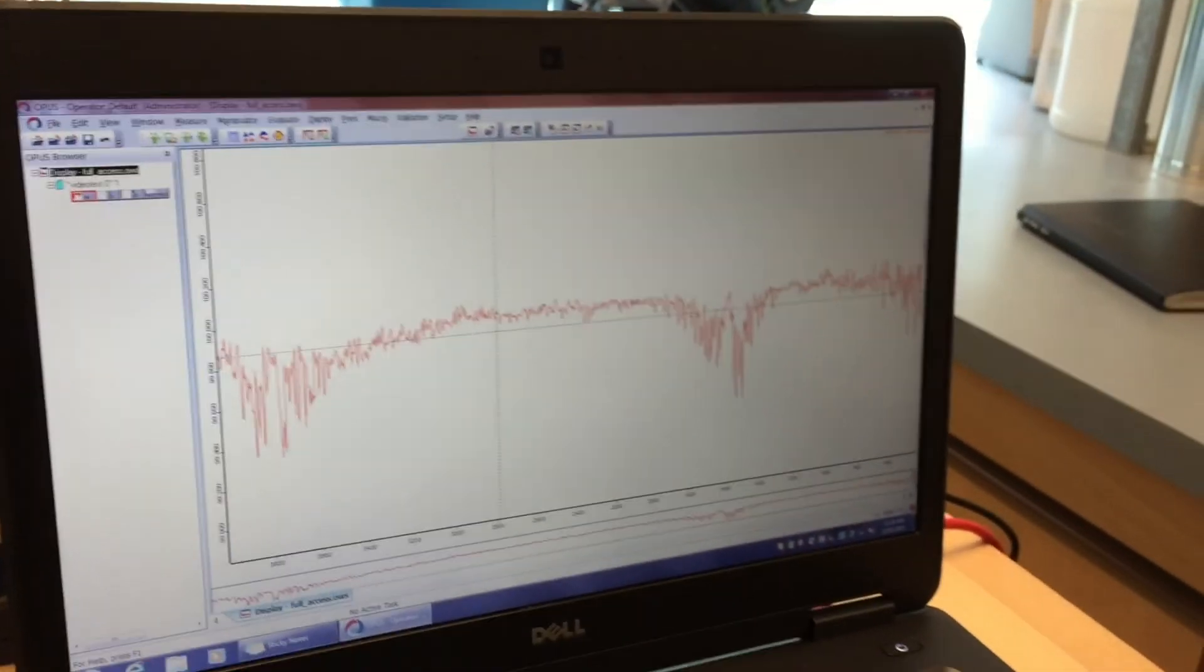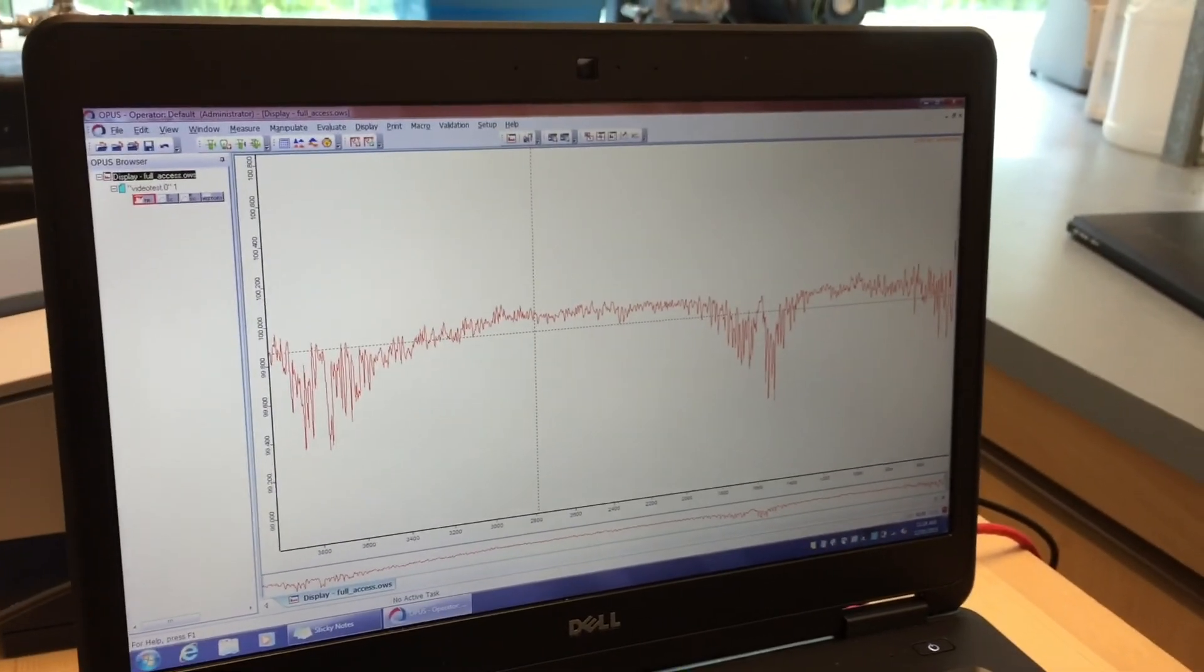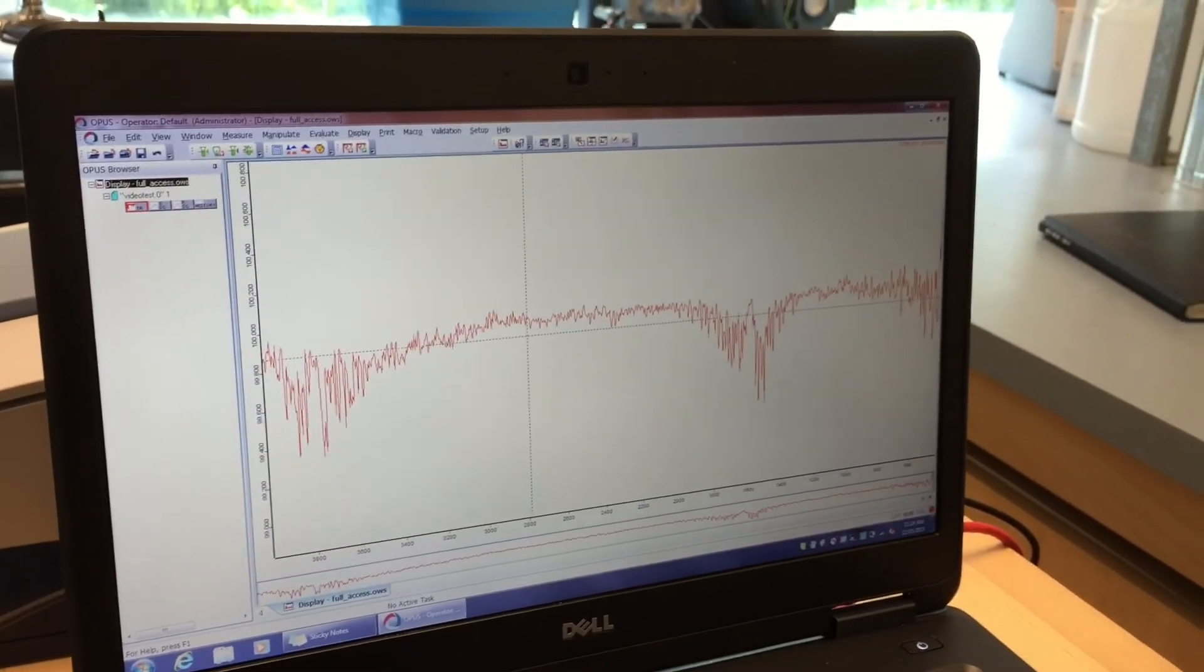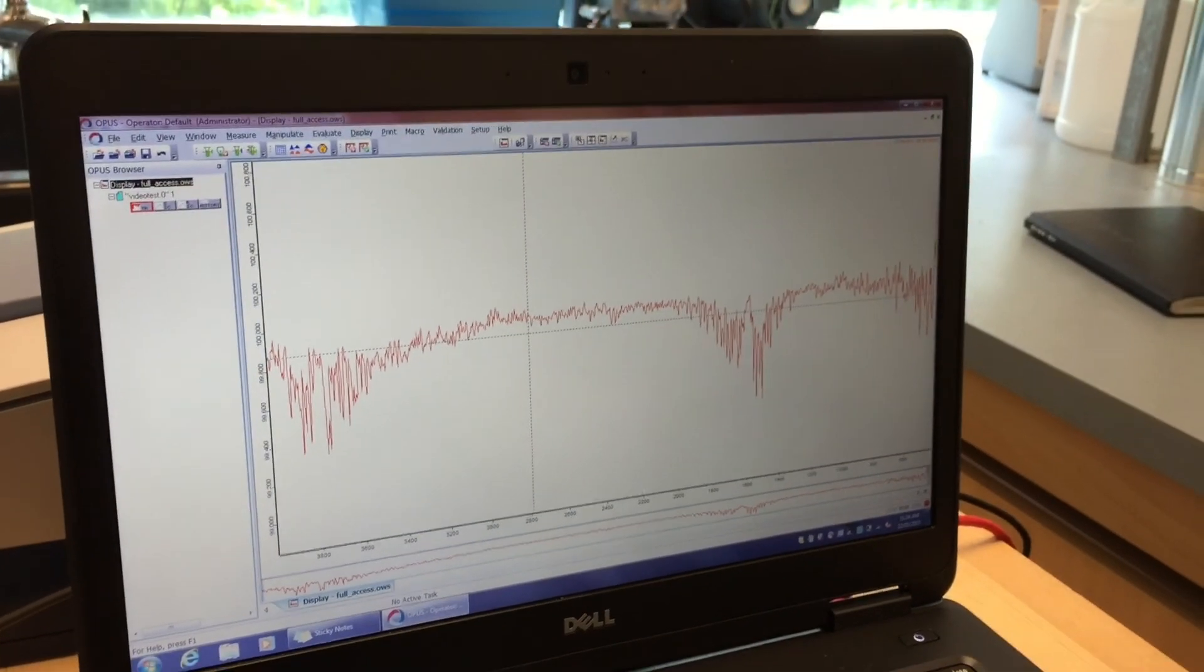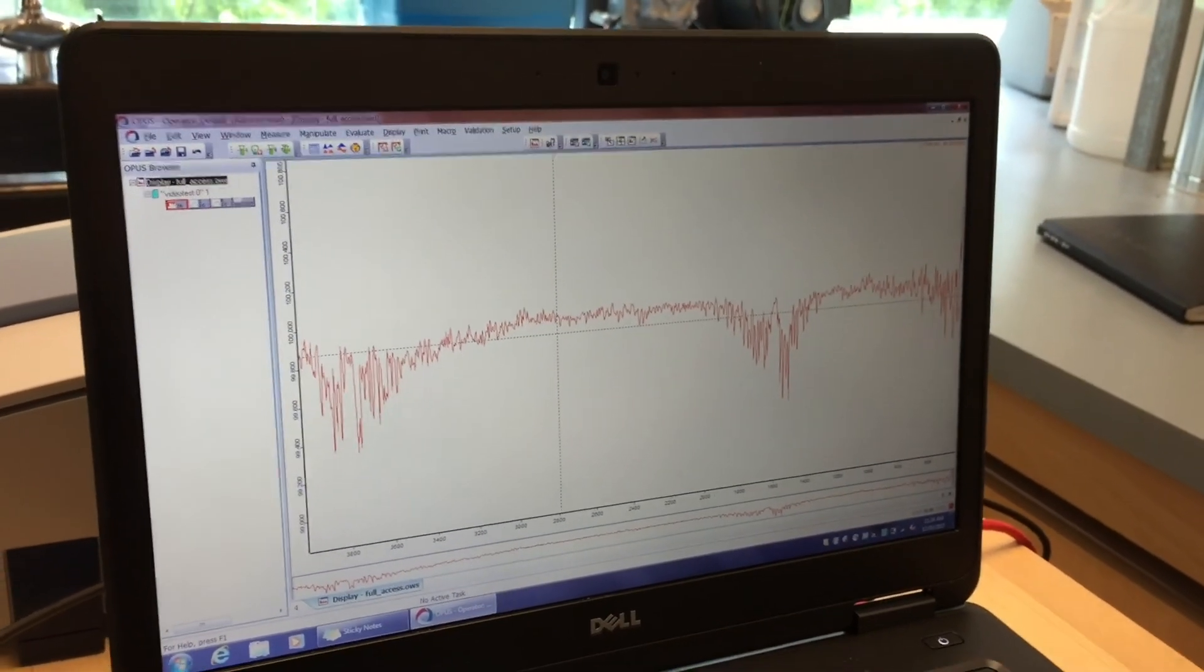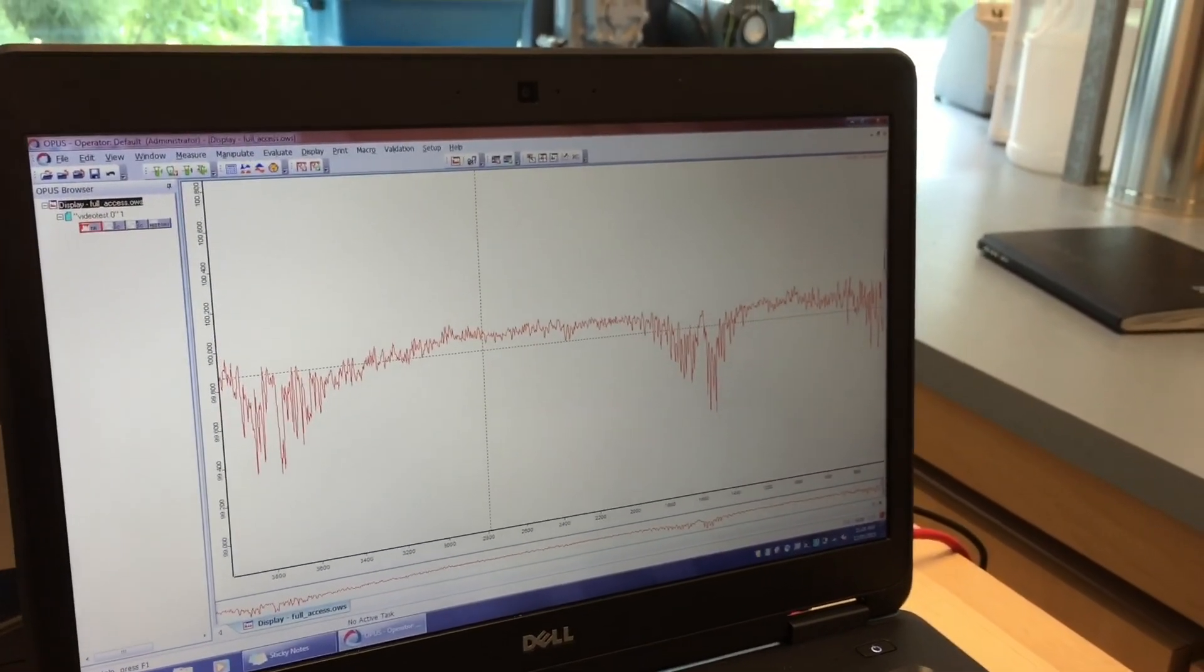But if you actually had a sample in there, hopefully you would get a signal somewhere. That is how you do a measurement.